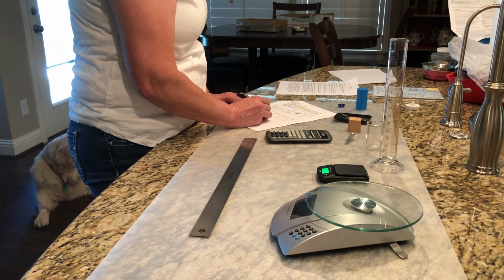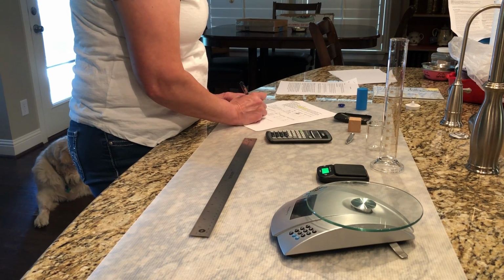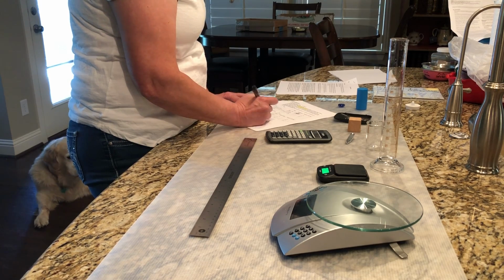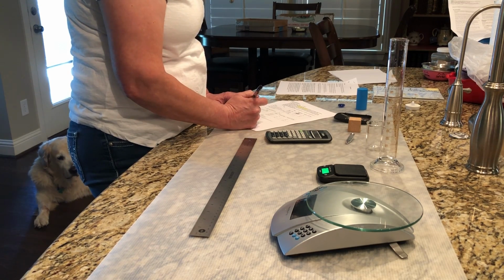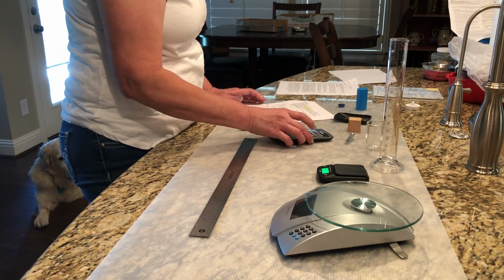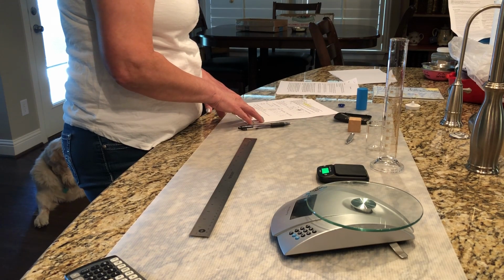25.672375. Significant figures would be 3, so the answer will be 25.7, because we're going to round the 6 up. So that's 25.7 centimeters cubed. Cleared that. Next thing is the volume of the nail cutter.